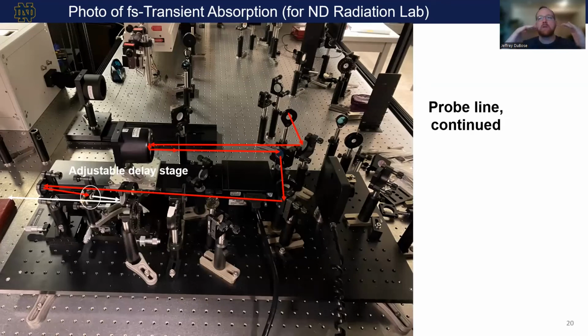And that's what we probe the system with. So it passes through that nonlinear crystal, and that's going to go here, and then our sample would typically be hanging somewhere around here. Okay, so that's the probe line.